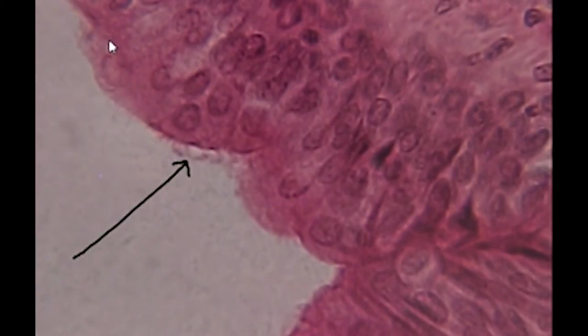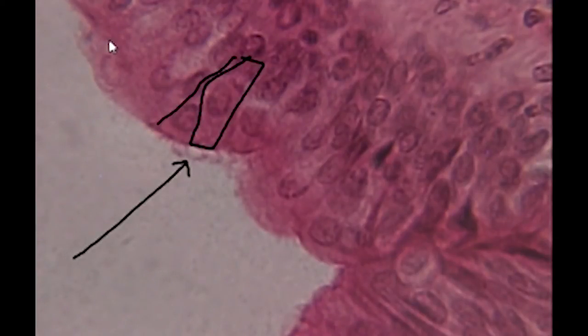Now the other thing about the tissue that we've talked about before is that it's pseudo-stratified or falsely layered. I'm going to try and draw an outline around some of these cells so you can see what we're talking about. Here are three cells. We have the cilia attached to them.